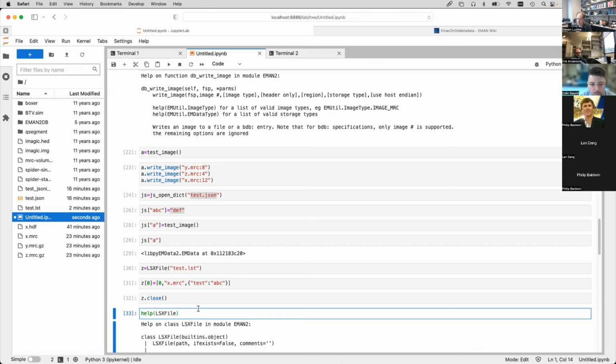I mean, that's basically it. So we won't be using the JSON files. We had a brief period where we were using the JSON files kind of like LST files. We've had 3 different versions of the tomography pipeline. We had a version from like 10, 12 years ago, which just did 3D alignments. Then we came out with a first draft of the newer variant of the subtomogram averaging, and that made use of JSON files briefly. And then this new format, which does the per particle per tilt alignment and subtomogram averaging and can do sub-nanometer resolution, now all uses these LST files.